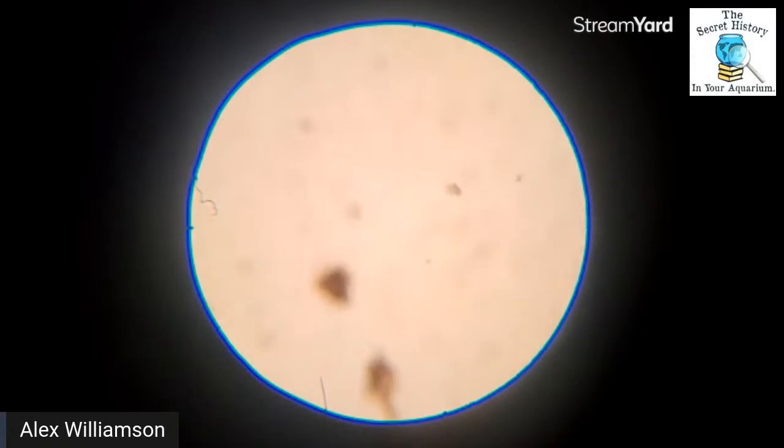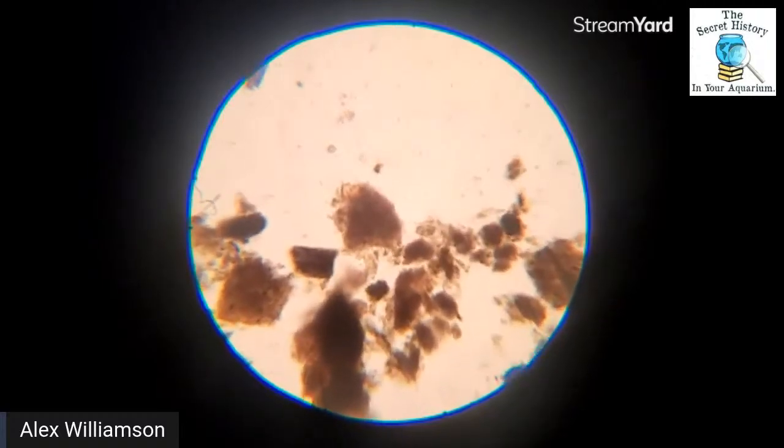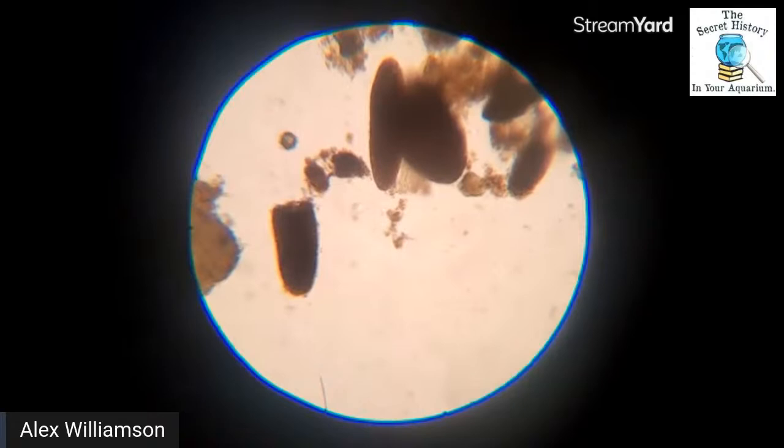So now that the light bulb has heated up this water to probably 90 degrees, sometimes you'll get a panic over the slide that's touching the light bulb, because they are like, what's changing? Why is it happening? And sometimes they'll all run. See, there's another perfectly round something, and that is either a seed, spore, or cyst, usually, like I was saying before.